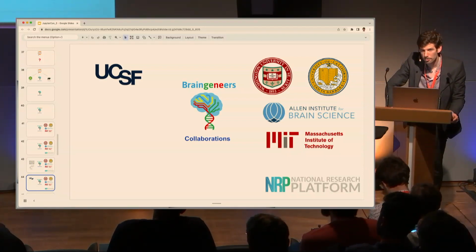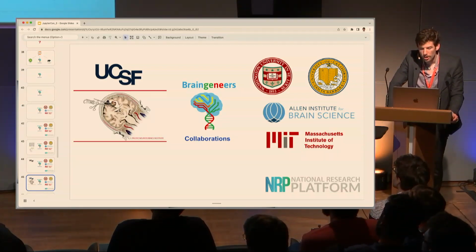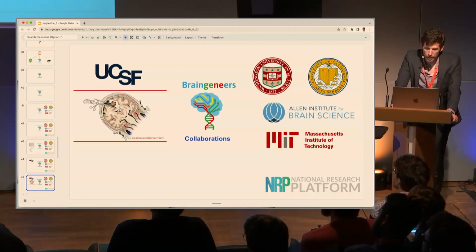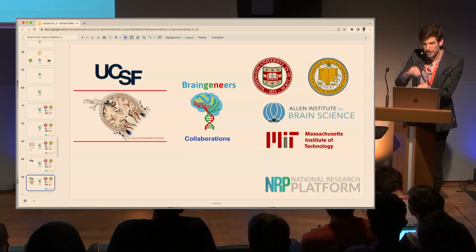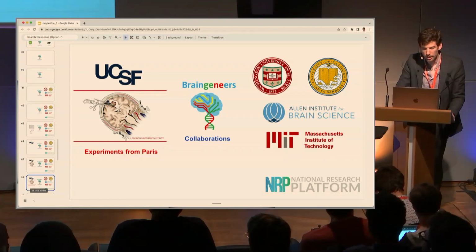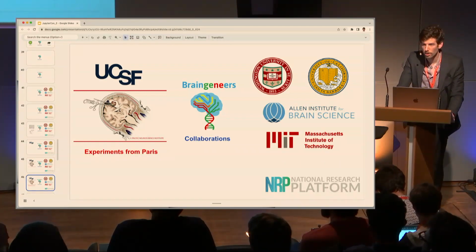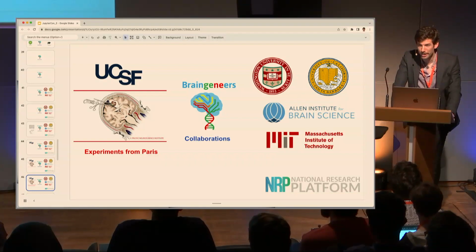This is the collaboration that I'm leading at UCSF, and for that, neurosurgeons are extracting human brain tissue from patients on the operating table. And then that tissue is being placed on the brain-computer interface that I showed earlier at the very beginning of this talk. And then we run closed-loop experiments on real human brain tissue. That's never been done. So that is a rather big accomplishment.